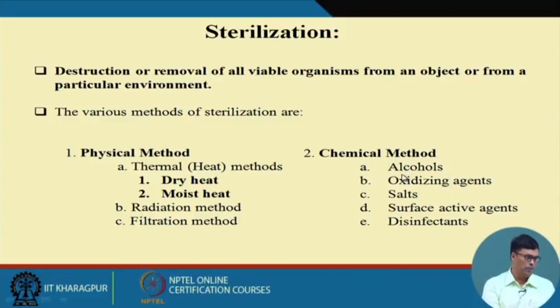Chemical methods we use are alcohol, oxidizing agents, salts, and surface active agents, but chemical methods are rarely used for medium sterilization. Mostly we use either heat or the filtration method.